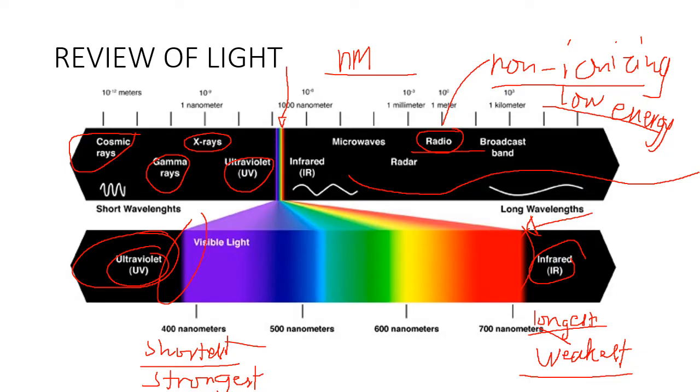So again, as the wavelength decreases, the energy increases. As the wavelength increases, the energy decreases. So be mindful of that concept.